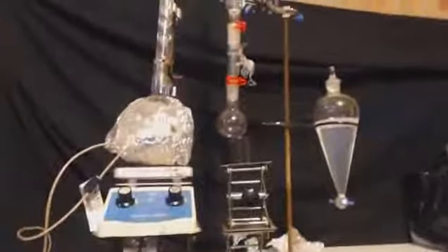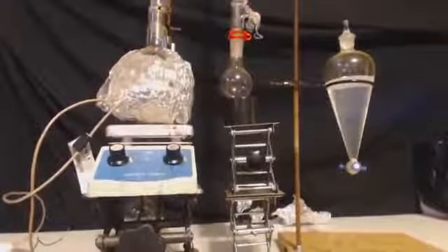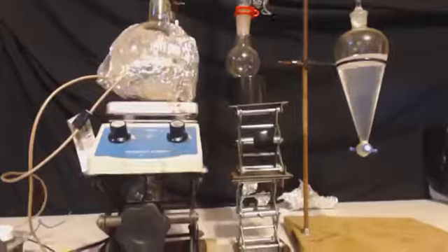I did this at a slow rate. Everything started coming off at 63, just a little bit at 60. Mainly it was coming off around 63. Then it jumped up to 80 for a little bit, 90 for slightly, very, very little. As you can see right here, I'm seeing what the stir bar is. It's at 67. Although by the time it gets up the bigger column, it's cooler.